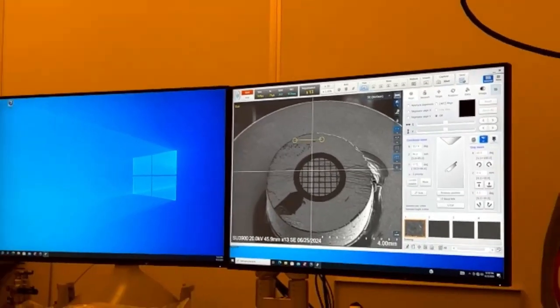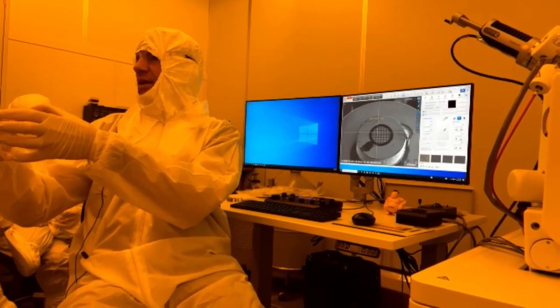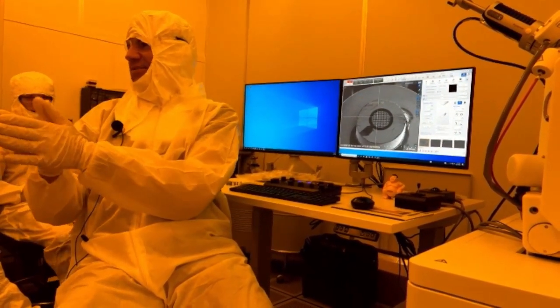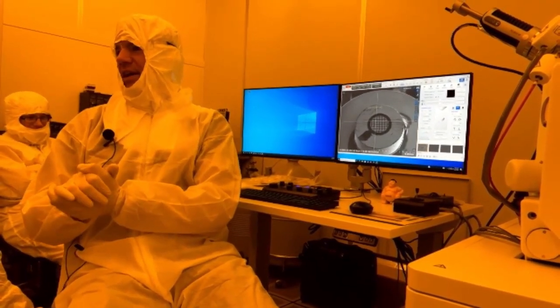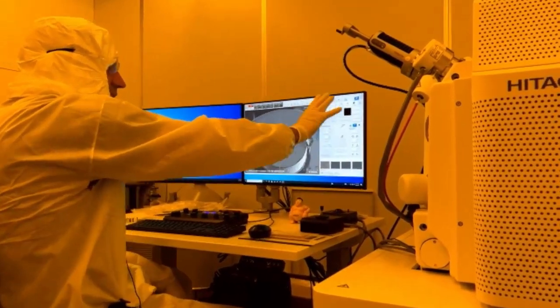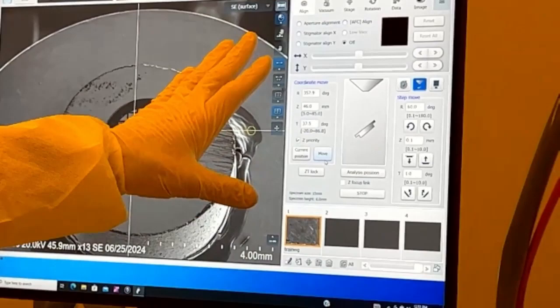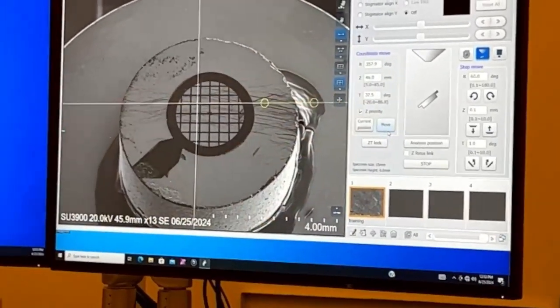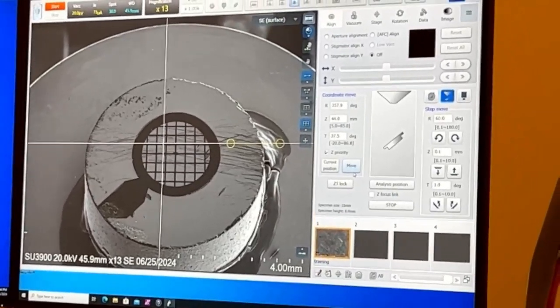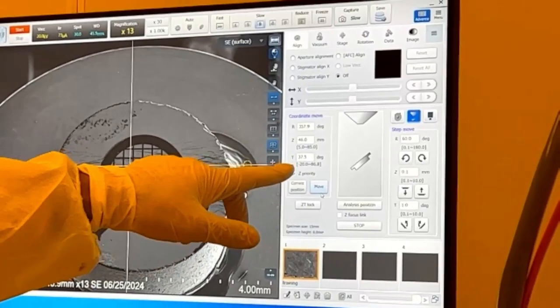When you tilt your sample, you want to make sure it's secured. You don't want to just set it on there because it'll slide off. Yeah, tape over it, so it's held on securely, definitely. So, like I said, this is nice because you can tilt and change your Z. You don't have to worry about hitting anything, and then you know, okay, I need to tilt 90 degrees, I need to drop it so much. And you also have negative tilt as well.